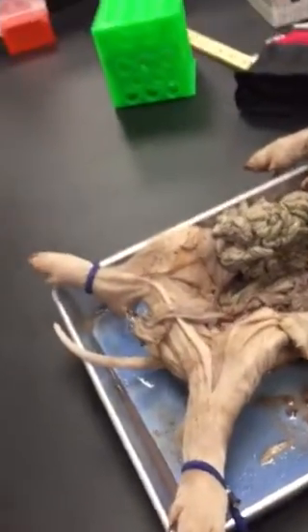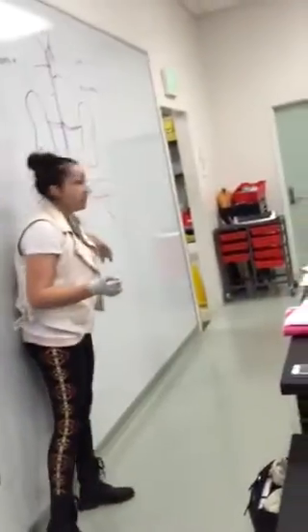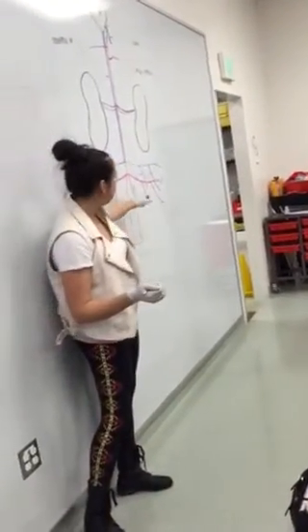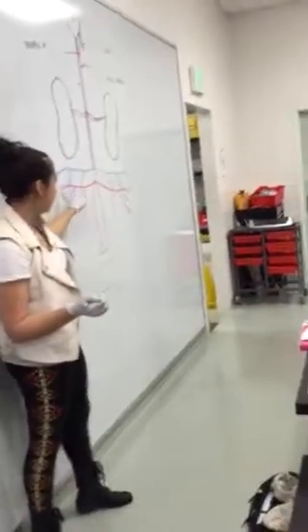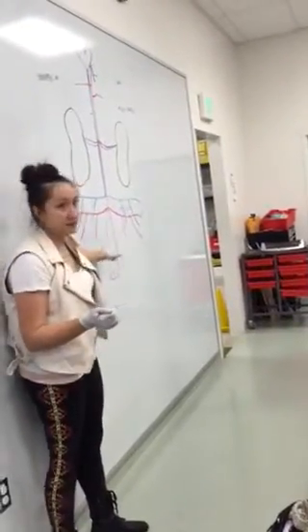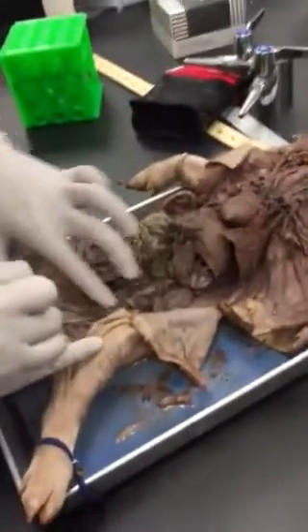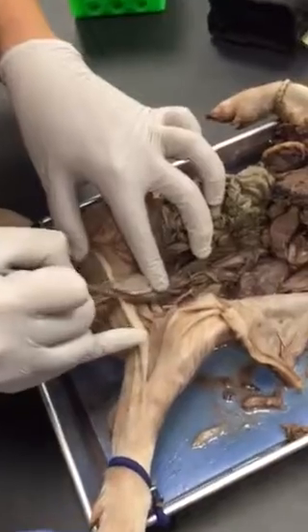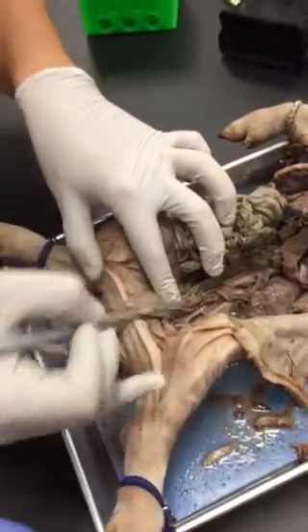So on this picture, that would be these two groups, okay? They're coming straight down the center, right? So now we're going to come out this way, and we'll find 1, 2, 3 more things, okay? So if we look out this way, we see 1, 2, 3 more things. Do you see that?